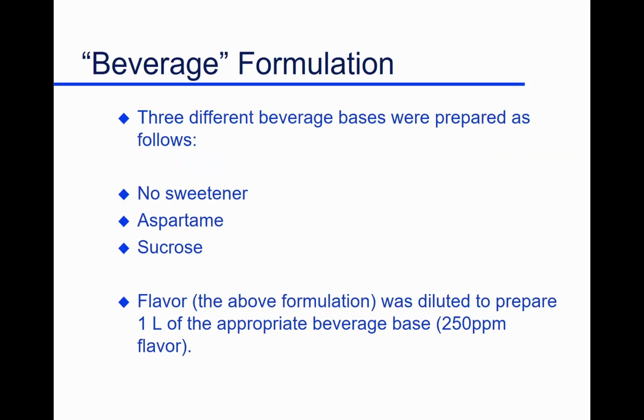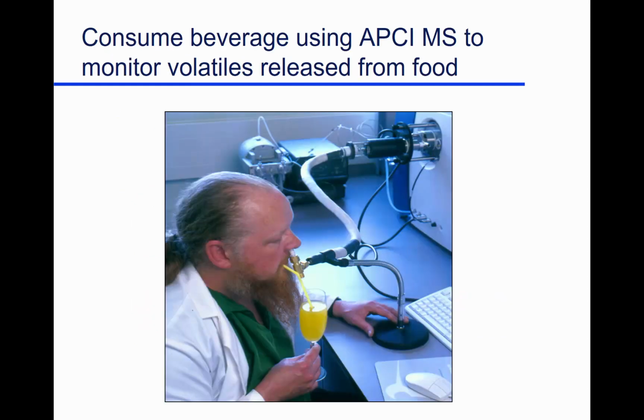And so this was a study where we used no sweetener, aspartame, and sucrose. So we made 3 Coke-type beverages. And we, again, diluted them out, and we end up having a person, well, this happens to be orange juice. So this is the person sitting here. He's sipping on a beverage, comes into his mouth. He swallows the beverage, fellow in the United Kingdom. So he swallows the beverage, and you'll notice every time you swallow, you exhale. You always exhale, there's some exhale breath. And so he exhales, and the machine sucks that into the instrument and analyzes what stimuli his receptors were given.